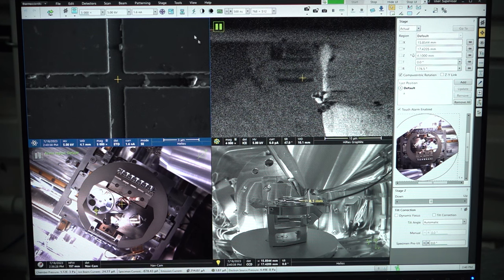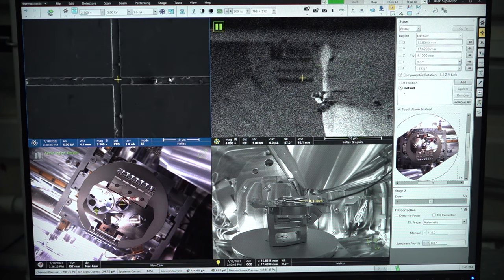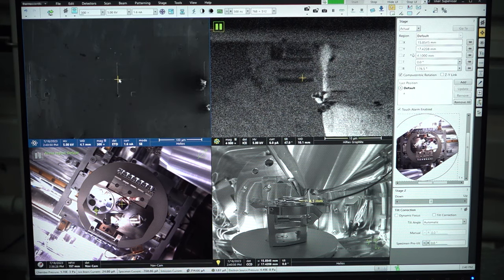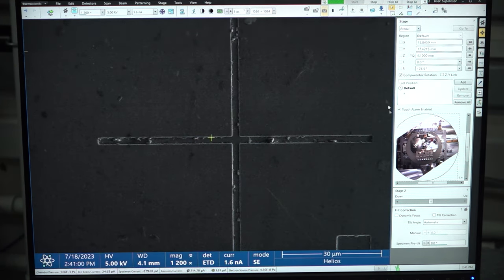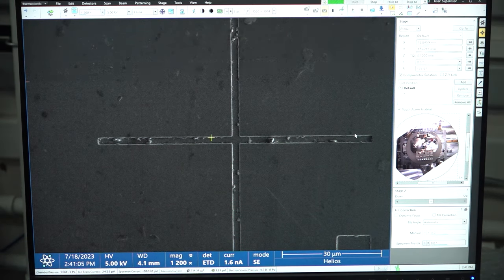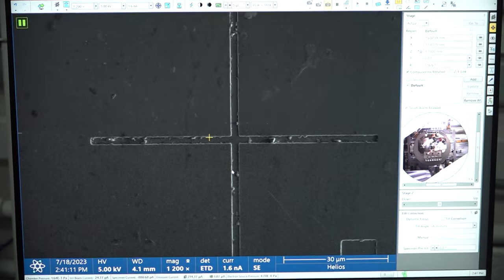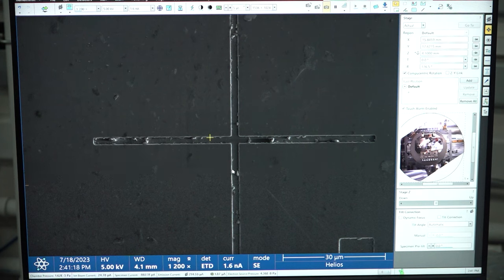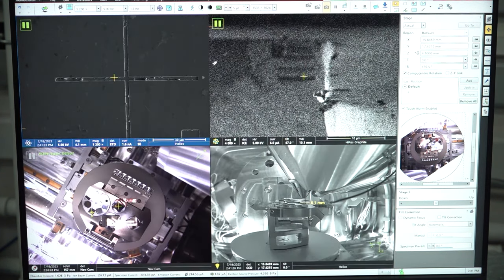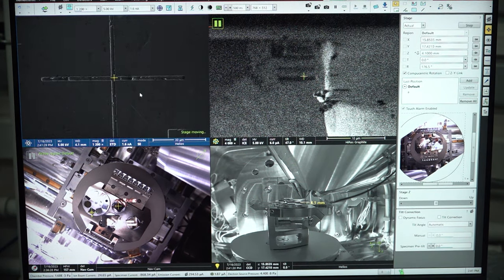The stage has moved to 4.1 mm which is the eucentric point. I will again focus the image, correct the astigmatism, and return to 4.1. The sample stage is now free to move in the Z position since we have already coupled the working distance. I would like to capture some images using the electron beam. We will click F2 for a very slow scan image for better resolution. The image is getting scanned at a very slow scan rate and the image quality is also improved. I can now capture and save this image — I am now live imaging the sample.